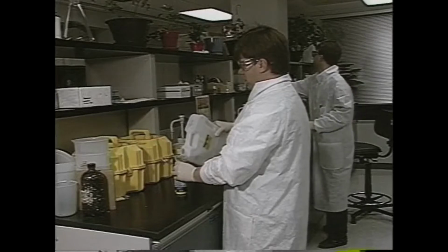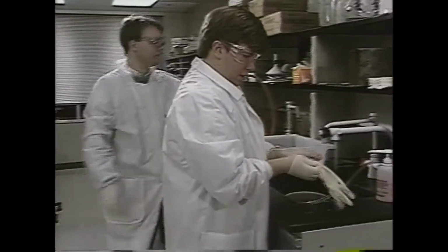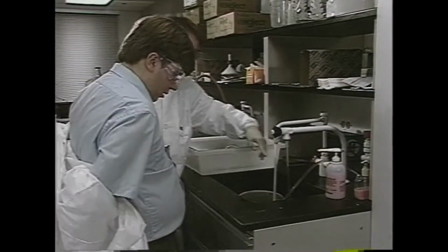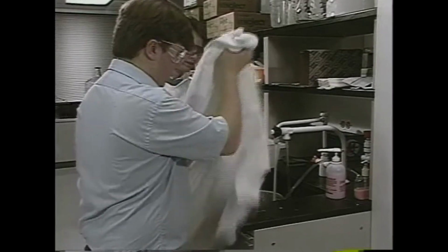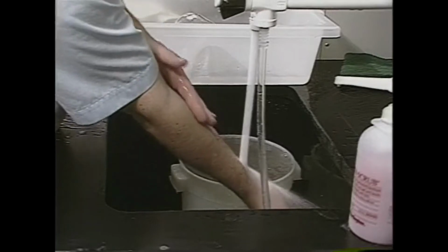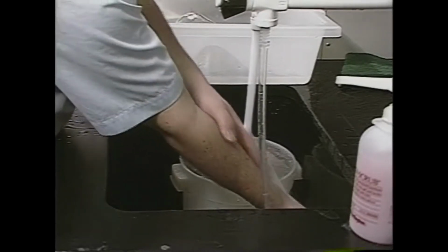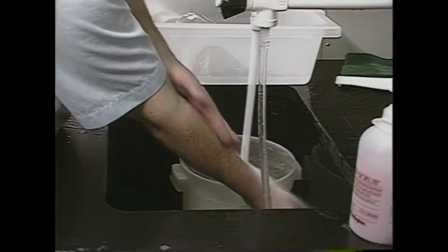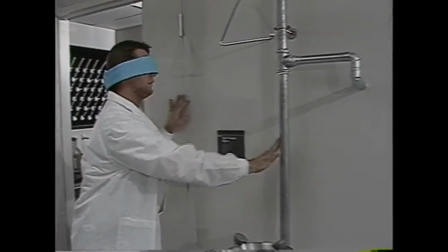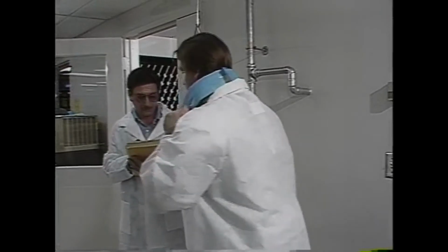If a hazardous chemical comes into contact with the skin or eyes, it could cause a localized reaction, or it could be absorbed into the bloodstream and circulated throughout the body. In these cases, water is your first line of defense against injury. Make sure you know the locations of the nearest safety showers and eye washes. In fact, you should be able to find them with your eyes closed, because one day you might have to.